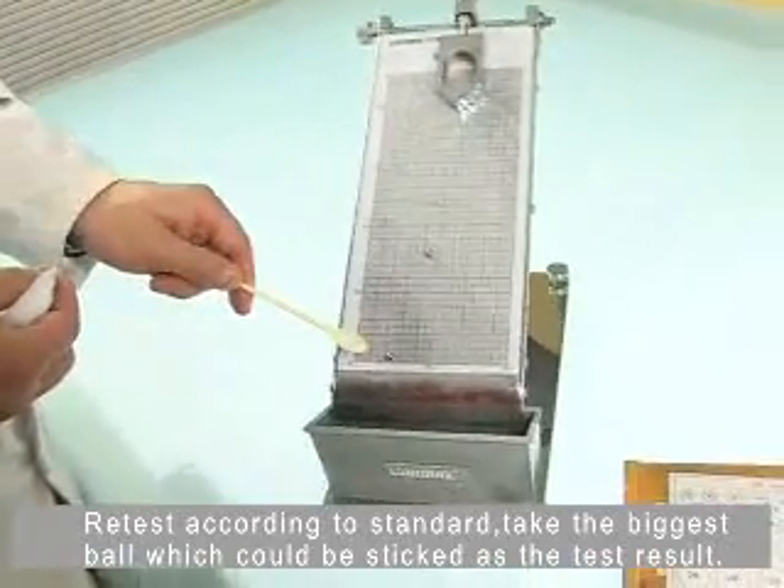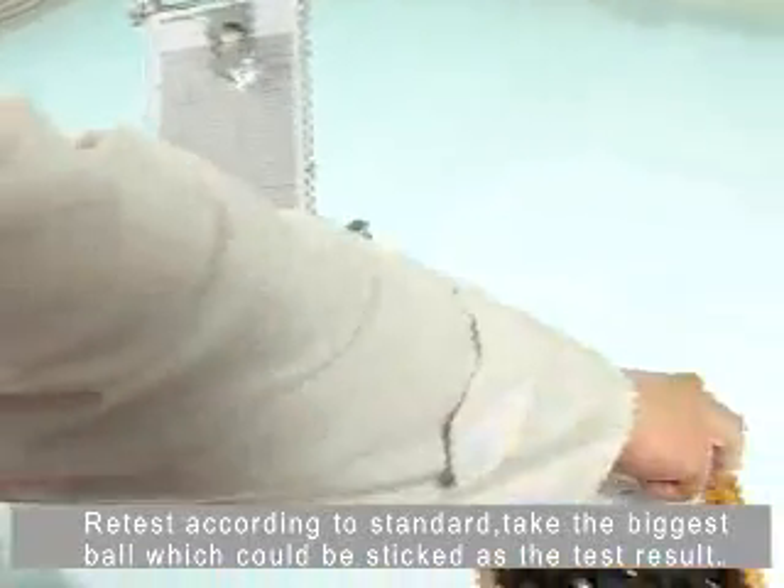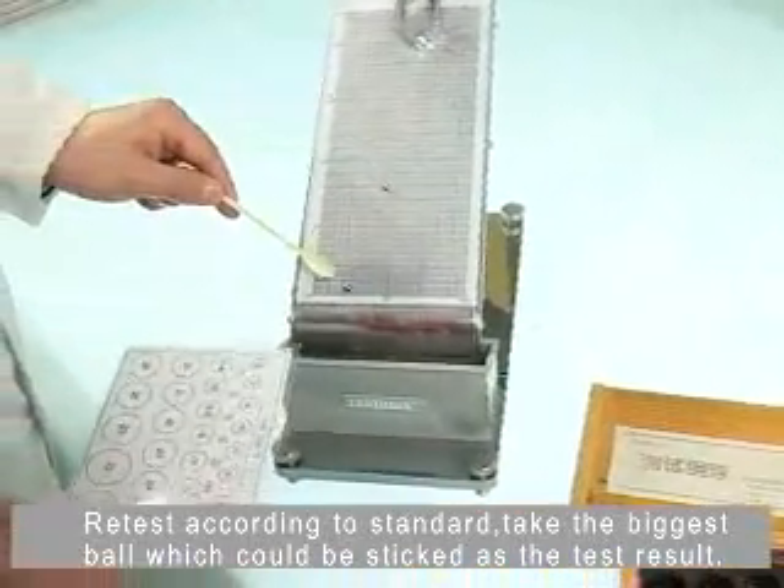Retest according to standard. Take the biggest ball which could be stuck as the test result.